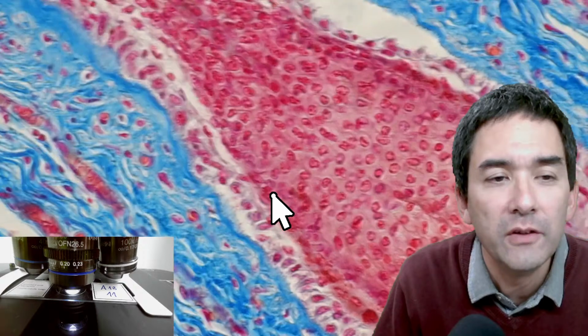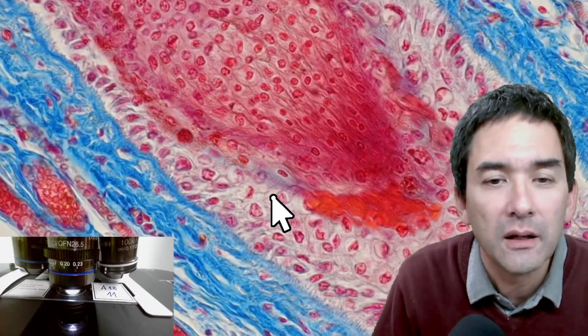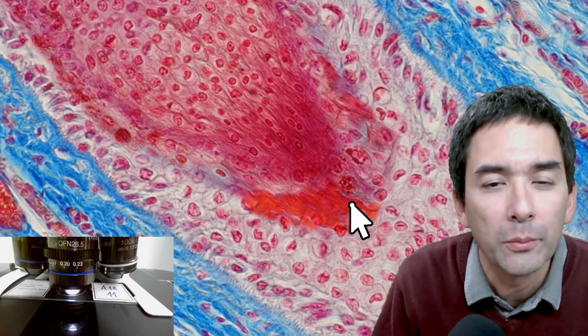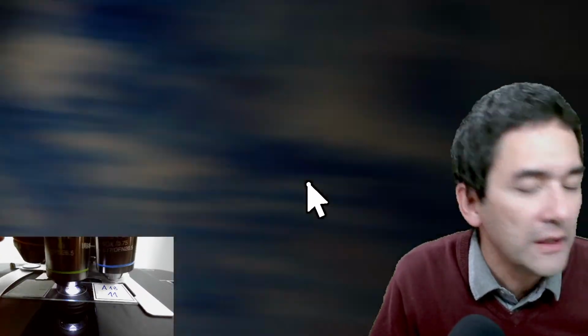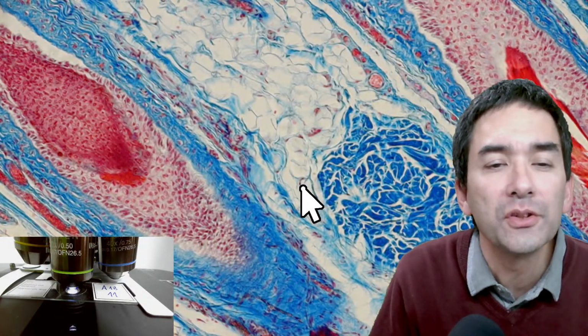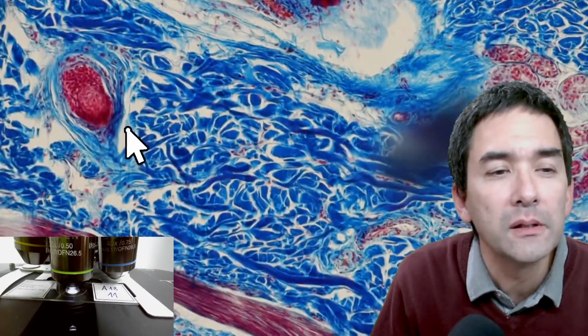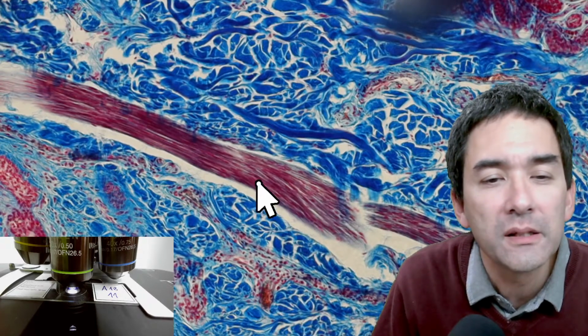Here again, you can see the individual cells, but over here I do not see, maybe this is a part of the hair being formed. It seems to be cut diagonally. So if you go down with the magnification again, okay, and then we also get a better overview. So this does look a little bit like muscle. Okay, over here, muscles.